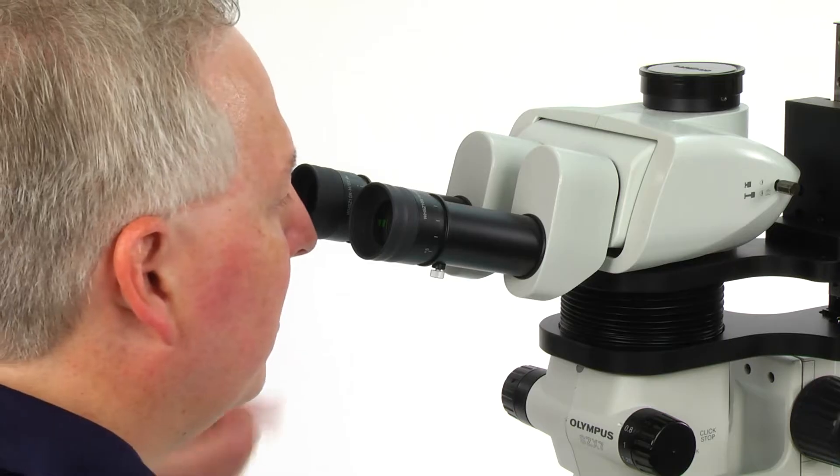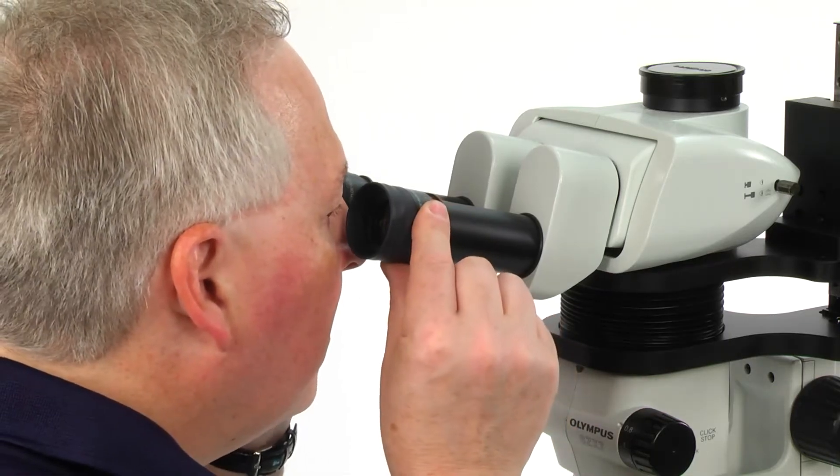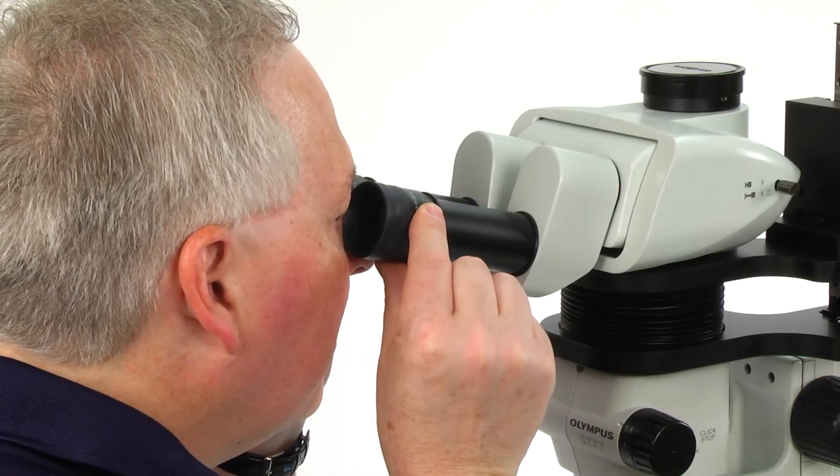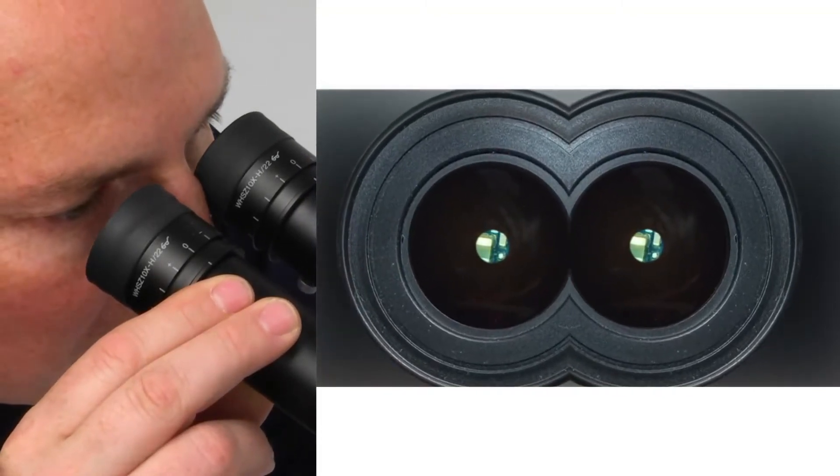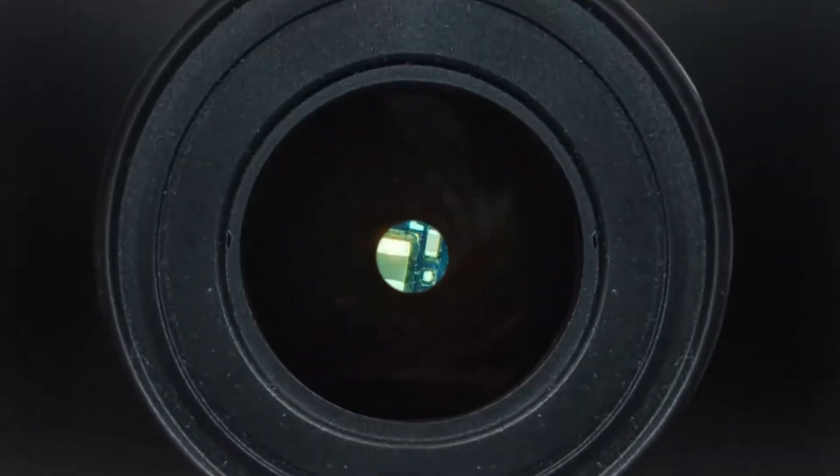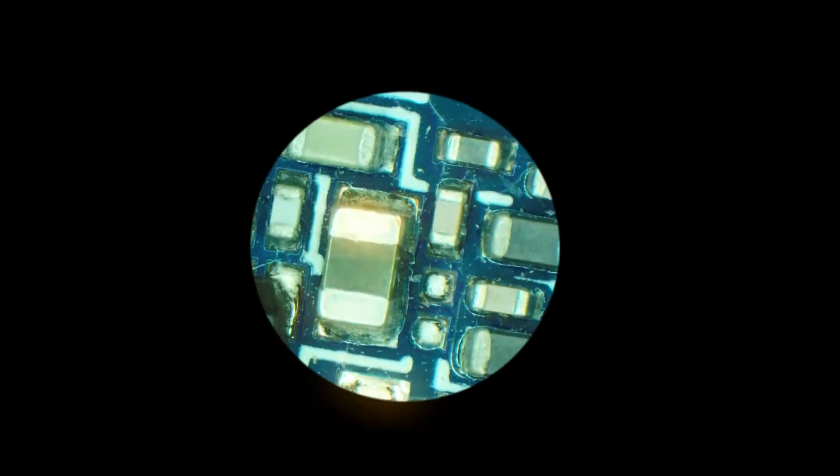While holding the left and right observation tubes with both hands, look through the eyepieces. Adjust for binocular vision by moving the eyepieces together or apart until the left and right fields of view merge to form a single image.